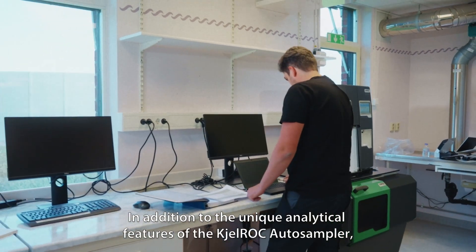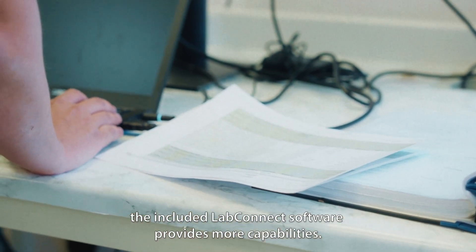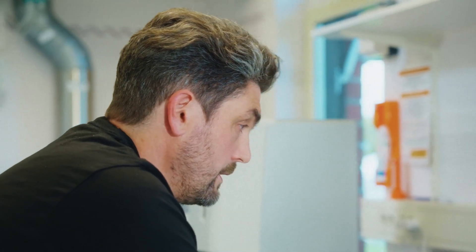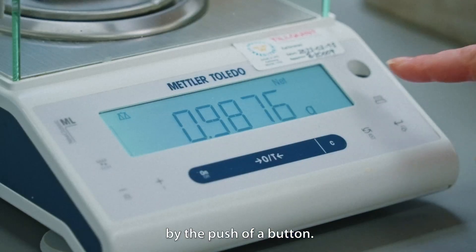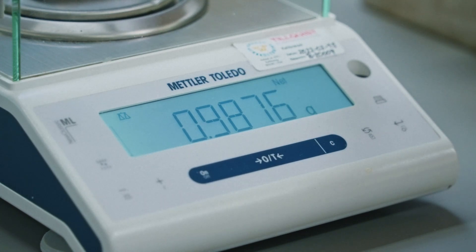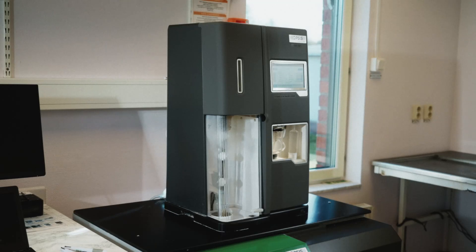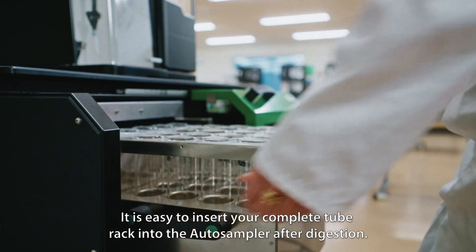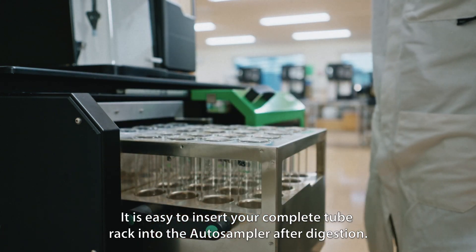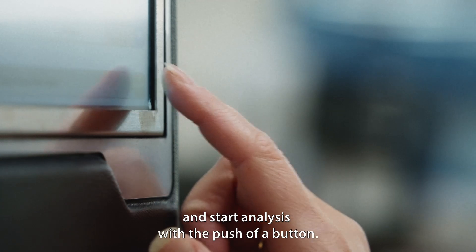In addition to the unique analytical features of the KjelROC Autosampler, the included LabConnect software provides more capabilities. Weights from a scale can automatically be transferred to LabConnect by the push of a button. After registration, you can easily send your data wirelessly to the Auto Sampler. It is easy to insert your complete tube rack into the Auto Sampler after digestion. You select your previously transmitted tube rack in the menu and start analysis with the push of a button.